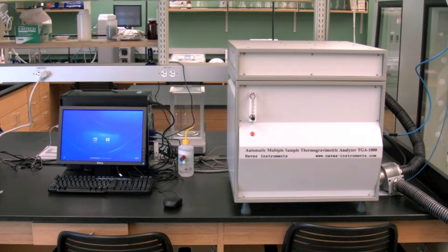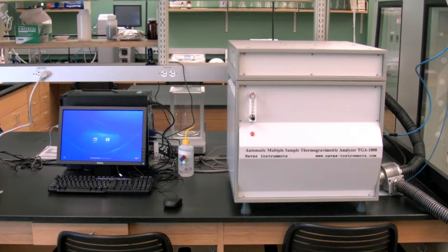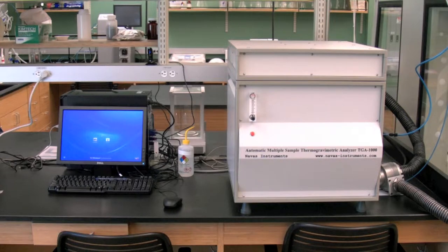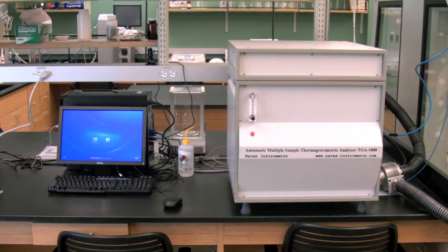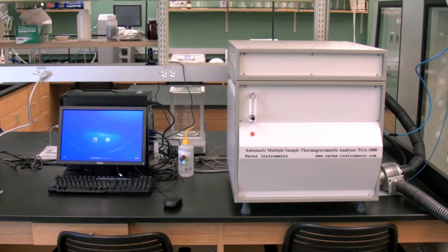The TGA consists of three main parts: the compressed gas cylinders, the instrument with blower, and the computer with software to operate this instrument.